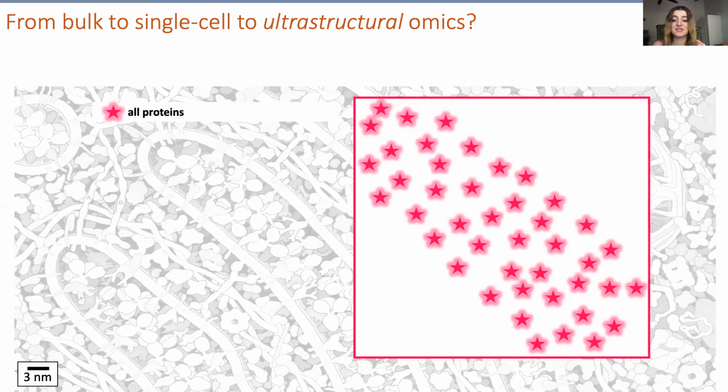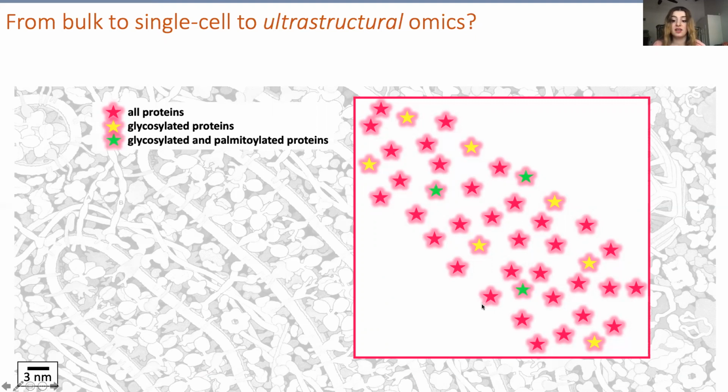Instead of targeting specific molecules with prior knowledge of what they are, we use a top-down approach, where we start from the big picture here, in this case, the total protein content, and then probe different post-translational modifications or protein motifs, adding a different level of selection every time. With enough specifications, this could lead to the identity of the protein.